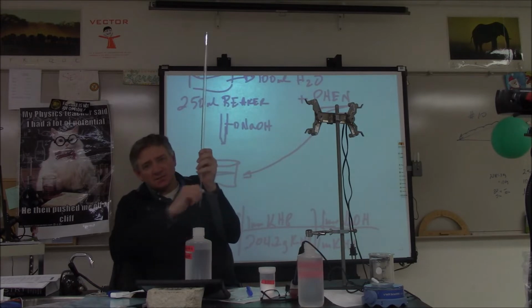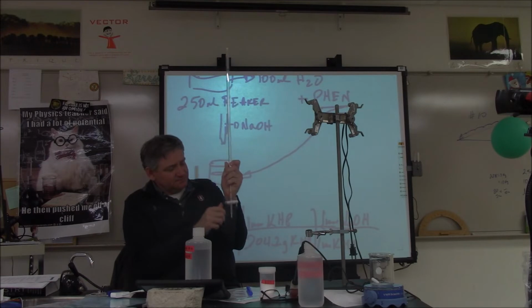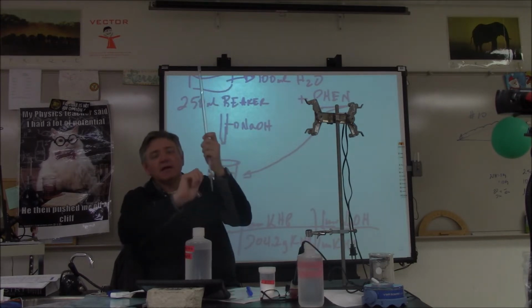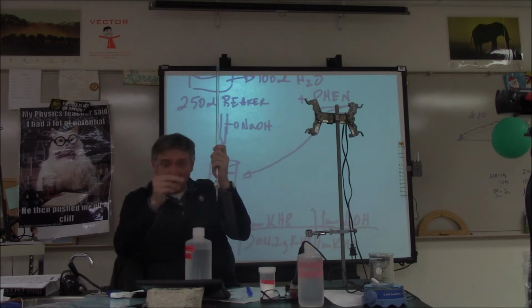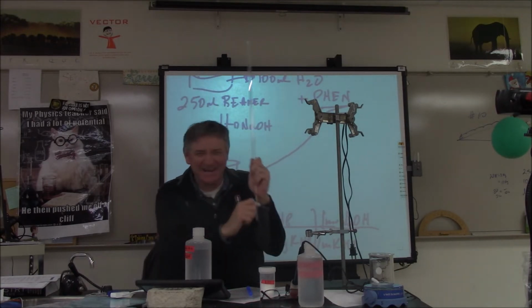Okay, assume that this can turn. Somehow or another this got frozen up. Okay. I'm not going to try and fix this right here, right now. Anyway, you can turn this valve on and off on normal ones that actually work. I happen to grab the one that's locked in place and I can't get it to turn.